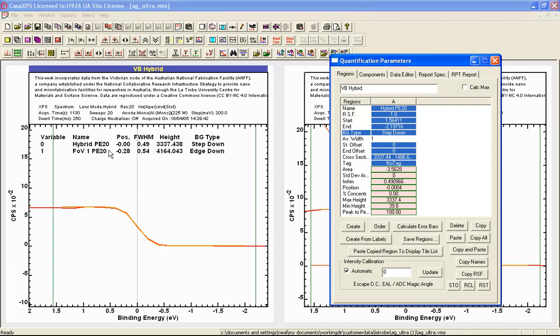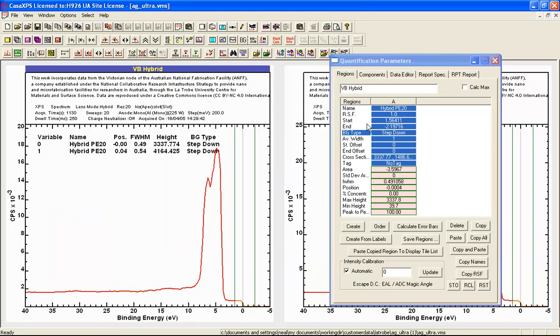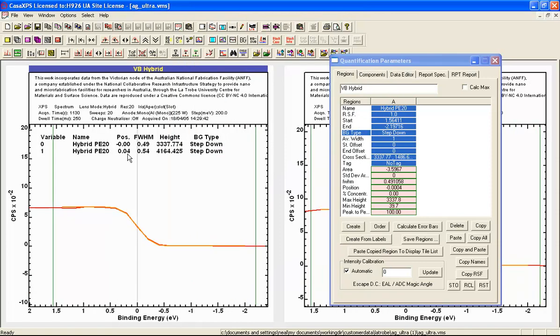And this differs from the point that the edge down background type is calculating for the field of view one. So if I wish to propagate this, we can see that both have a value very close to zero once we use the step down background type and the point of inflection is used to indicate the position for this edge.